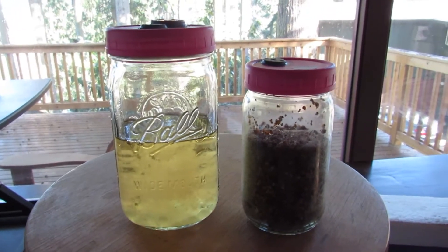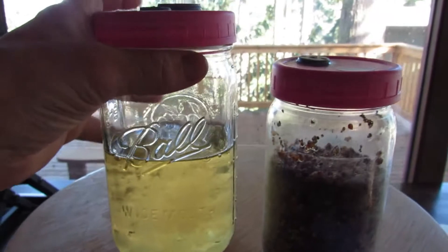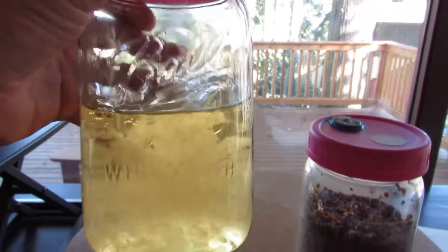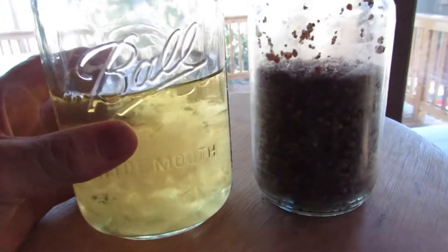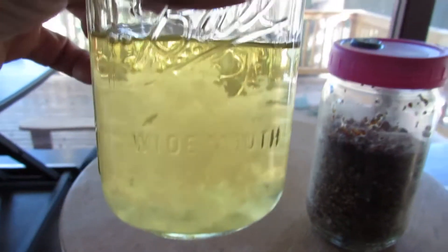Okay guys, I just wanted to make a quick little video here. I had done one video on liquid culture that looked cloudy, but this one's a little something different and I had an idea I think you guys are gonna like. This is liquid culture that was not viable — you can see it still looks glassy.